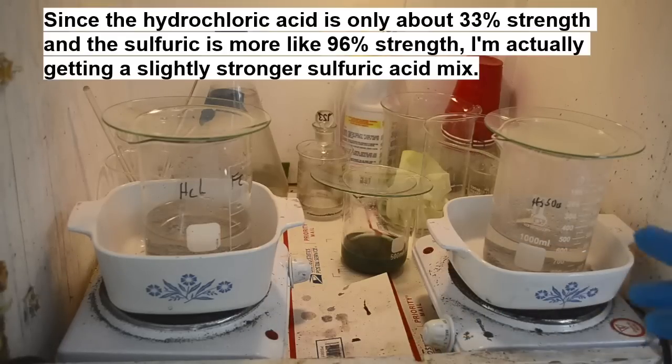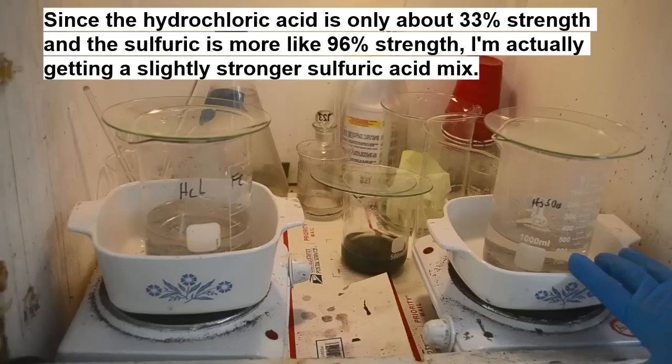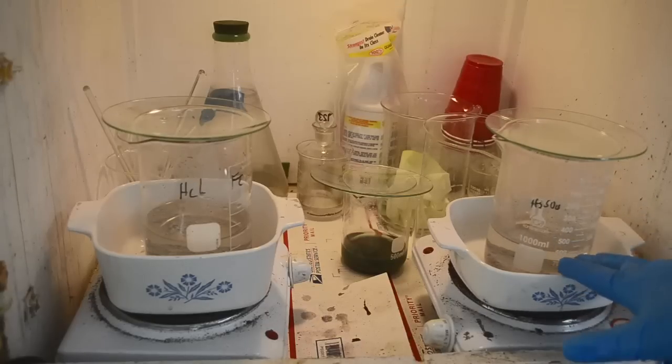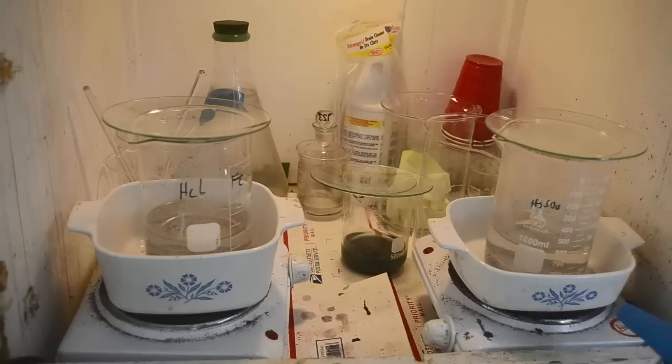And you say, well, these should be the same. Well, I know the sulfuric acid is going to dissolve some silver. But I think a 10% solution should be adequate to dissolve out any copper that's in here, if it will dissolve out copper. All right? I'm not 100% certain that either one of these is going to dissolve out the residual copper. We will see.